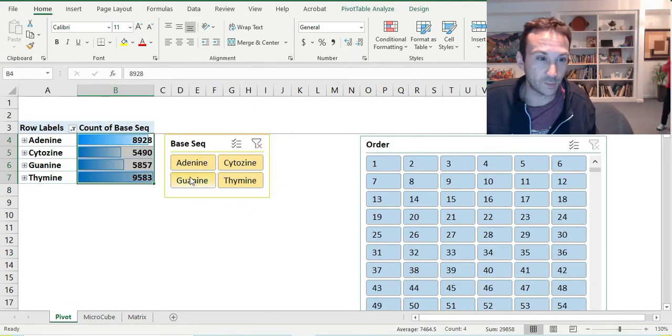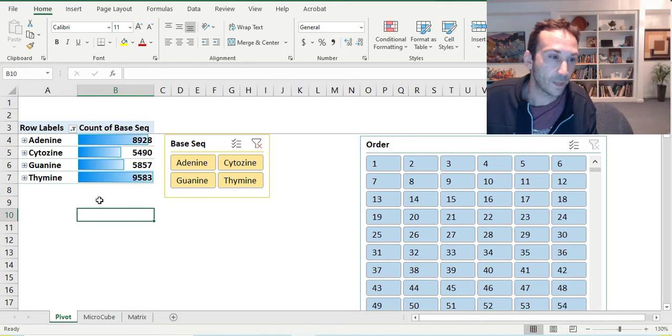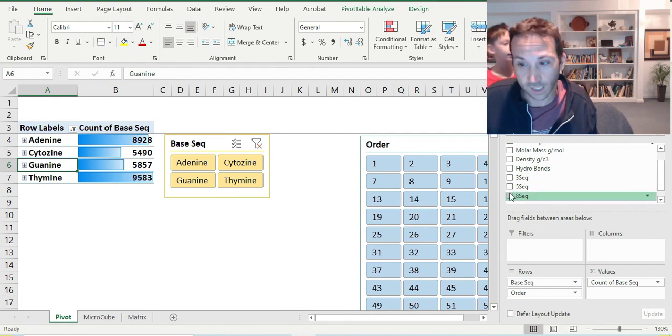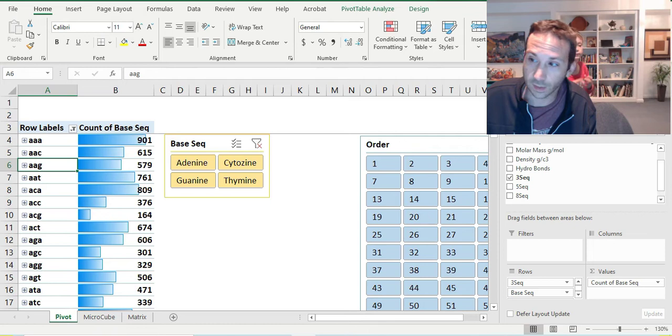I know I've lost my kid and I've probably lost you too, but this is important for those who want to mess with these files and start to work on how we're going to diagnose how to attack this virus. Here's what I'm trying to say: there are different character sequences, and I've mapped out 3s and 5s and 8s. So every 3-character sequence looks like this when you bring it into the table.